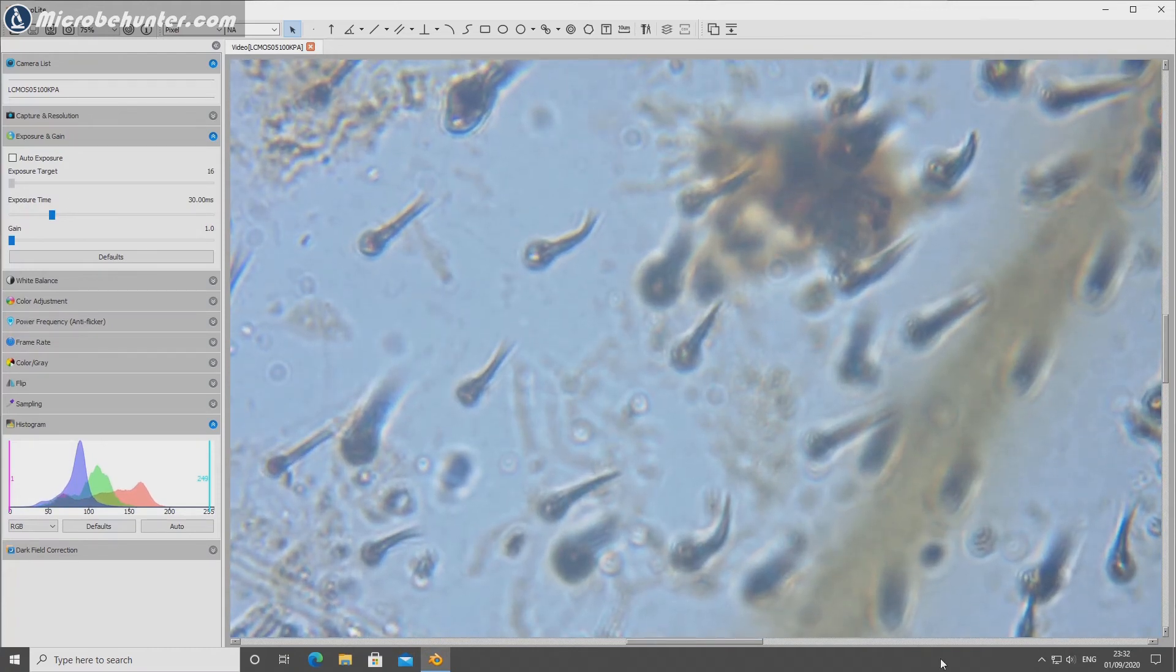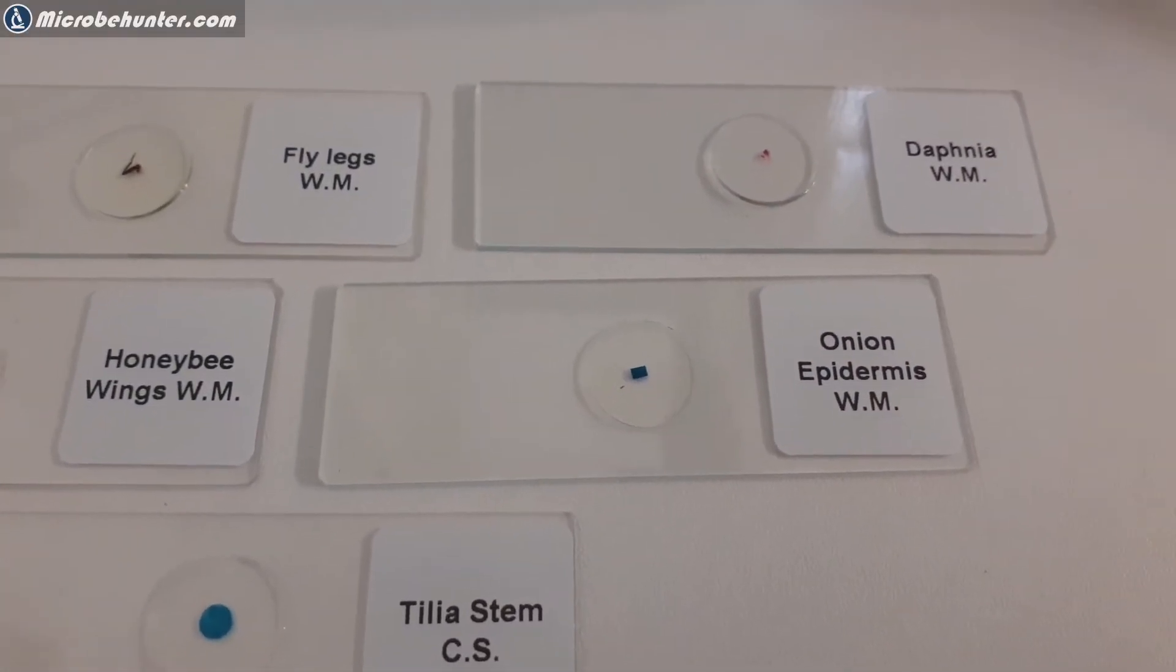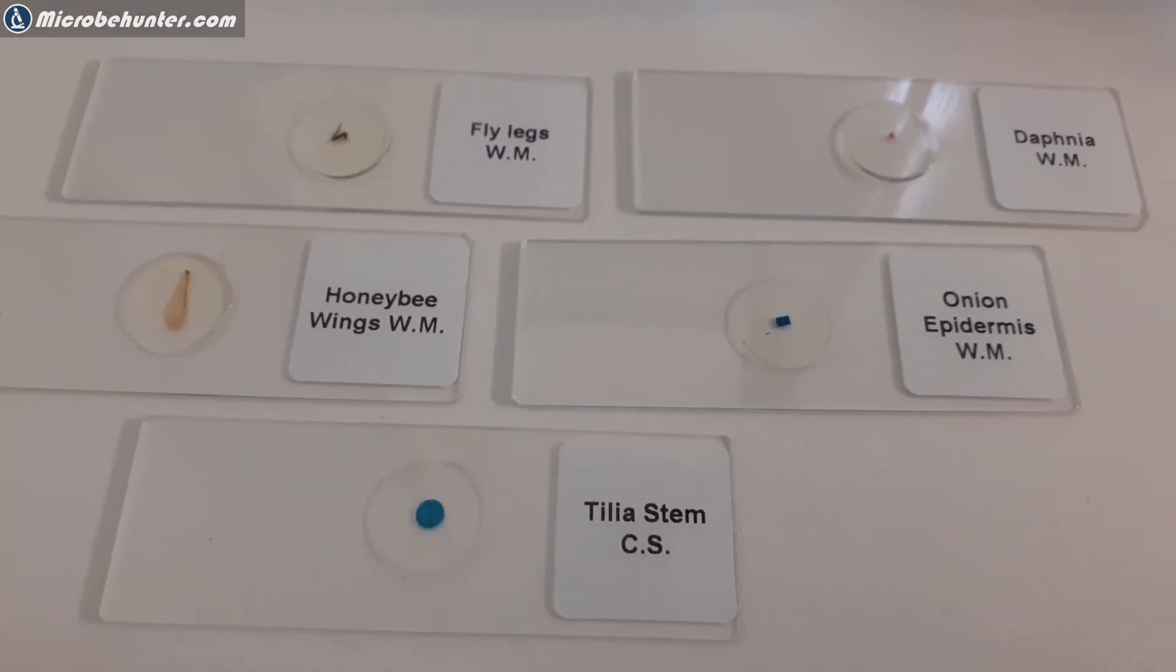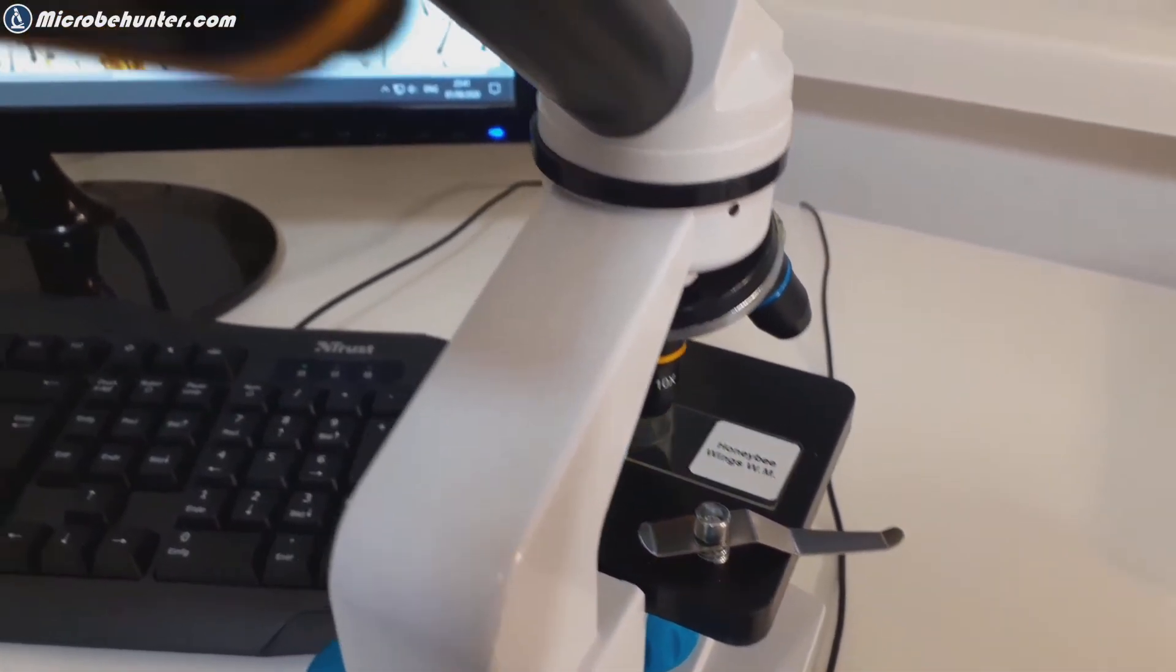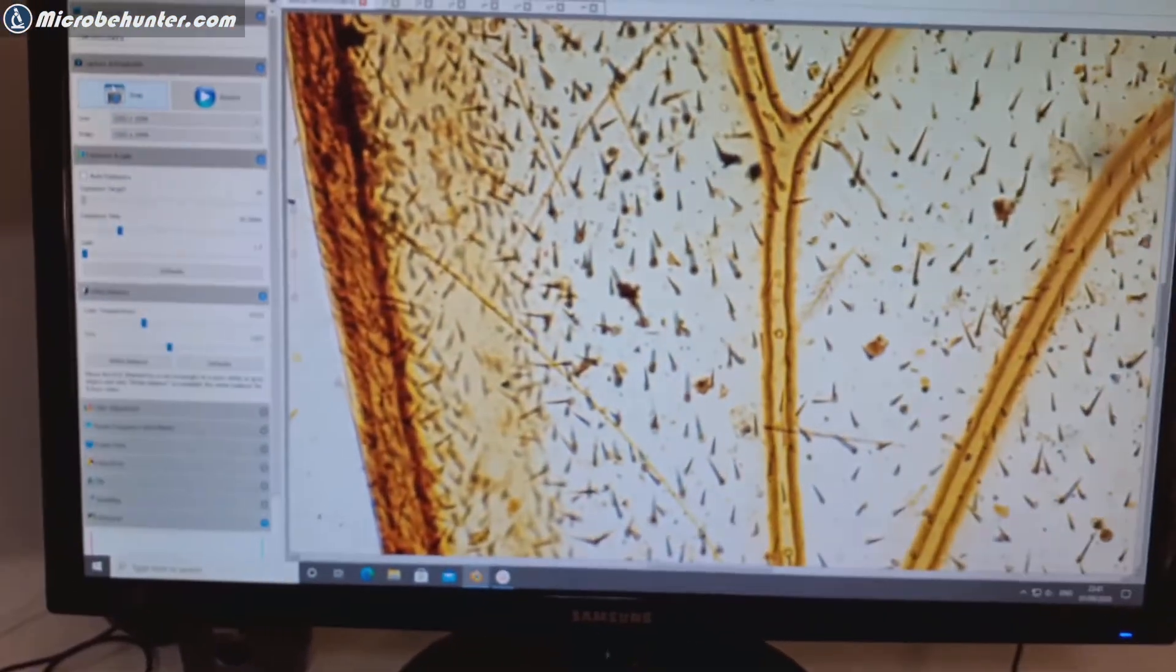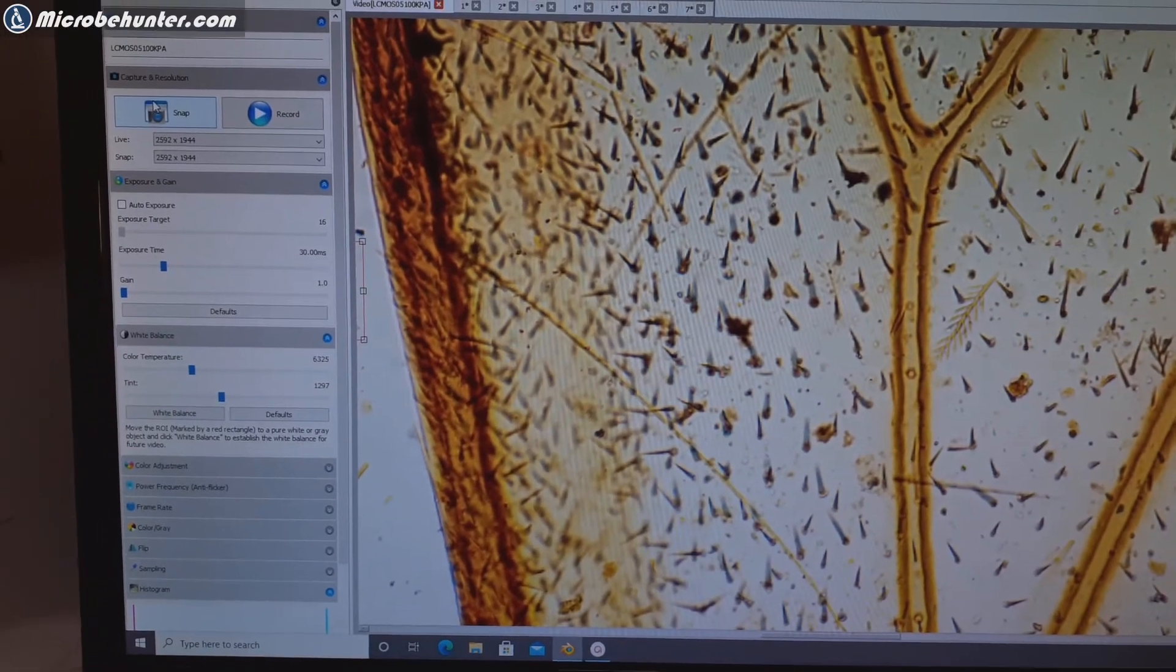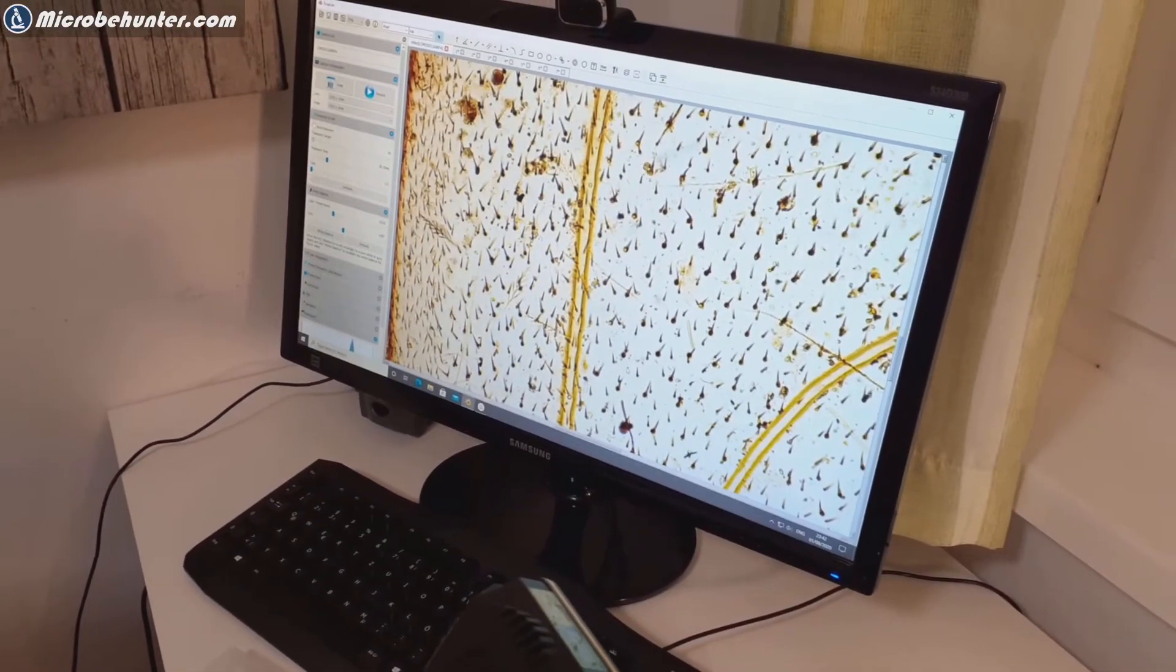You can see that with a 400 times total magnification, 40x objective multiplied with a 10x eyepiece, I'm getting a sufficiently decent result. I'm just going to show you right now also the different slides and I'm going to put them under the microscope as well and simply to show you this is how I have connected everything. Here's the USB camera which I obtained separately next to my computer.